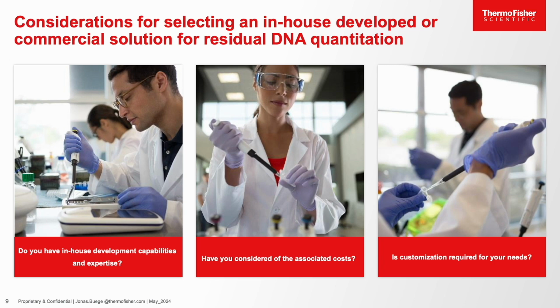Another thing are cost considerations, which is the primary driver to start developing internally. Cost savings, one should be asking, is there a true cost savings by adding 1 to 2 FTE on an in-house developed process? How much is the true cost per test, and how much are you really saving? How much money are we really saving short, mid, and long term, and what is our trade-off between the program risks and the costs? If you develop an in-house assay, you are about 1 year ahead from implementation. You might get pushback from regulatory bodies, not necessarily on the first, but maybe on the second regulatory review on your method and coverage and not meeting the regulatory requirements.